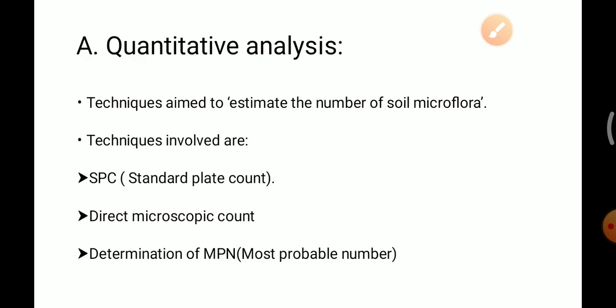In this video lecture, we will discuss methods of studying soil microflora. We will see different methods for studying soil microflora. First, we will see quantitative analysis.